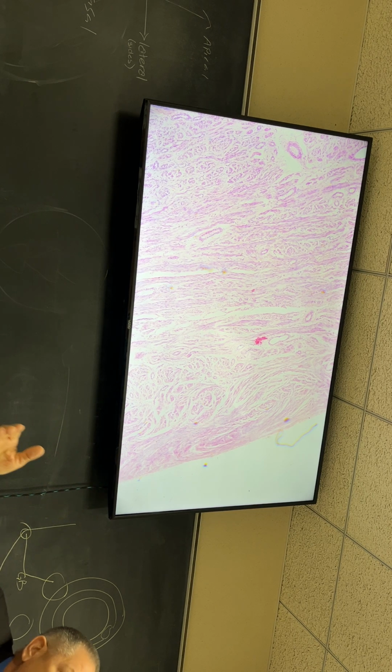I have to show you pieces of it because it's too big to show on a microscope slide. So what we have to do is go to the outside and then just kind of scan across to the inside. So this is the outside here, or I should say the inside here, right? Depends on how you think of it.